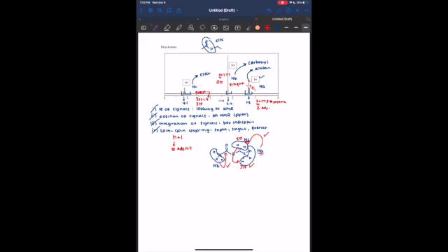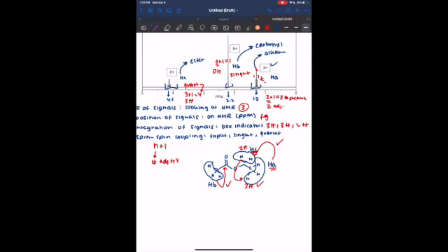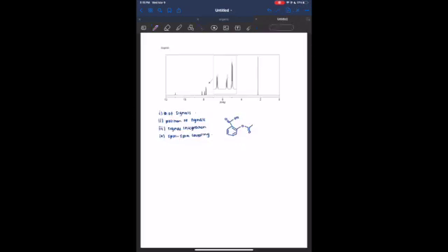So those are the 4 different general NMR concepts, which include the number of signals, which we determined was 3 separate signals, the position of the signals, and what functional groups they corresponded to, what we would see in the compound, as well as the integration of the signals. So it would be the amount of hydrogens that shared the same signal, and then the spin-spin coupling theory, which uses the n plus 1 equation, and how we can use that to determine the adjacent hydrogens on the molecule.